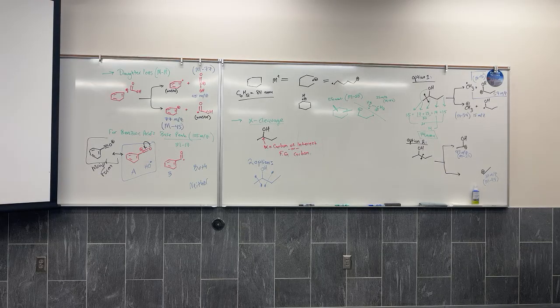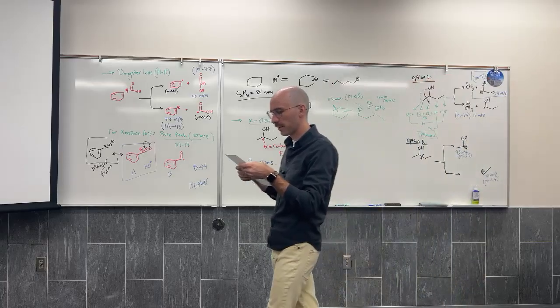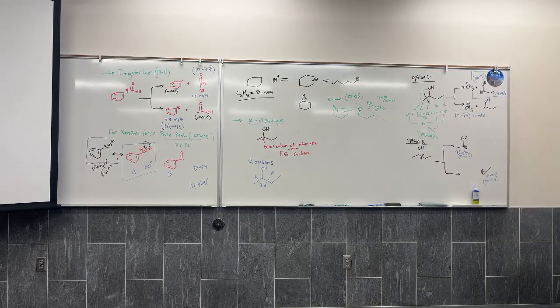Oh, because the base peak is 45, not 44. It is? The base peak is at 45. It's dead on the center between 40 and 50. Yeah, they're not easy to read, are they?